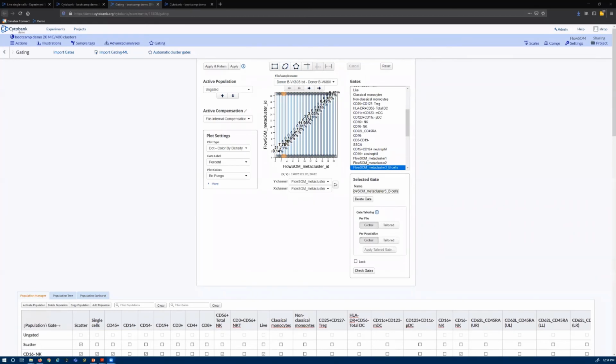So the actual viSNE 1 and viSNE 2 values, as we talked about in an earlier question, we don't recommend putting those into the FlowSOM clustering. We're just visualizing on top of it. So if your viSNE map was run with a low or high iteration number, that's not going to impact any of the clustering results. It will just change the look of the visualization, how the metaclusters are overlaid on the viSNE map. Perfect. Thank you very much.